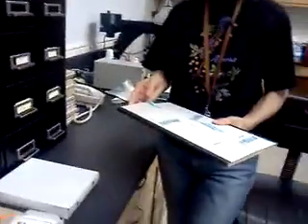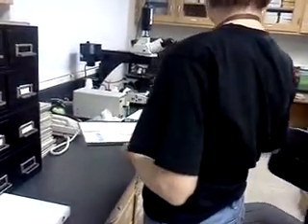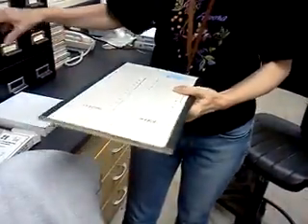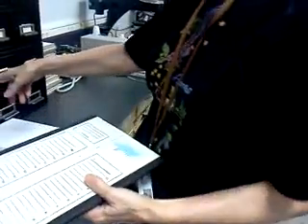So I would recommend that you buy some of these sleeves because you need them. The reason we use them is for day-to-day work. Like, you just had one and I don't know where it's at. Yeah, so you need this to dry the slides in, to transport the slides in, but then what Nicole is going to have to do is put the little labels on it, put them in a card, and put them where she can find them again in the order.